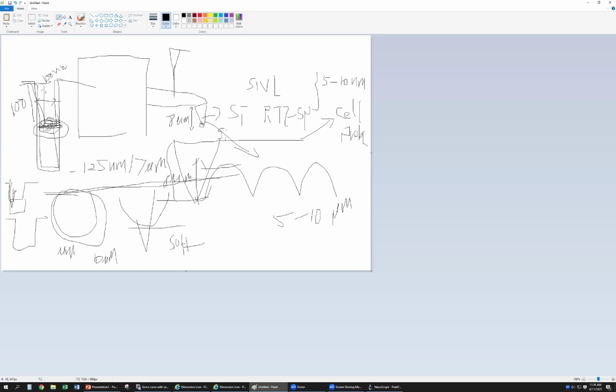Okay, so I need to calibrate the force. This one is for the depth. You know the depth, right? Yeah, I know that. It depends on your image, whether the force is here or here. That's quite difficult, right? Okay. That's how we choose the probe.